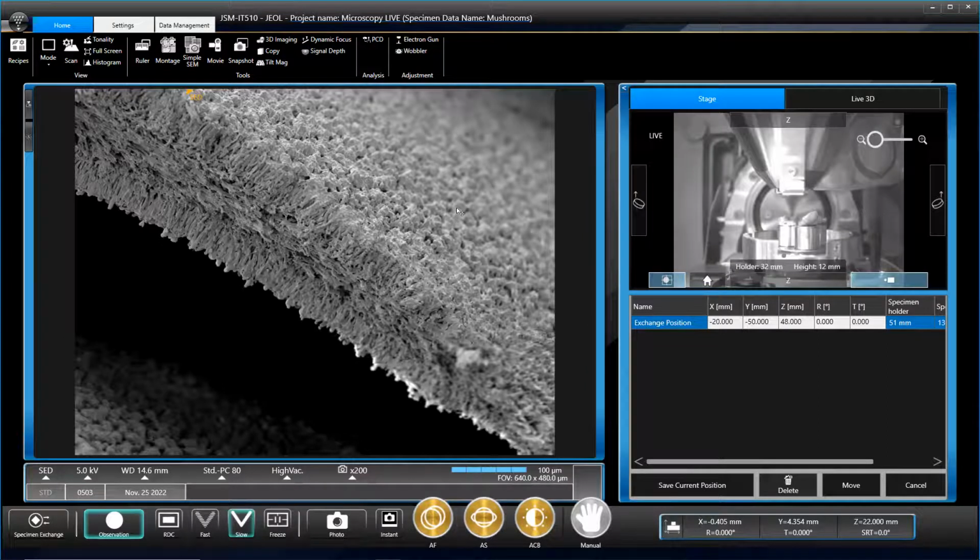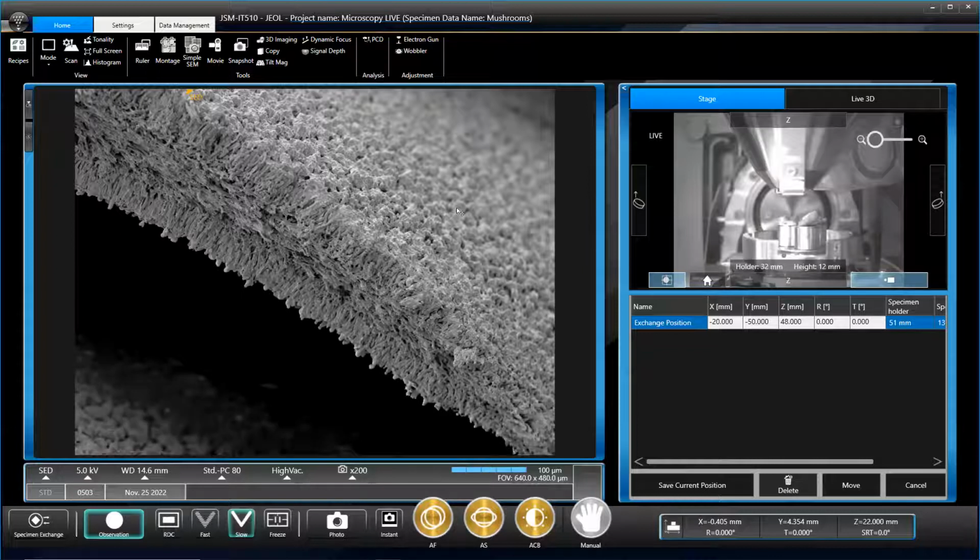That's a cool image though, Cesca. Really nice. That's very different to the other oyster mushroom. It is arty as well, like you see the shadow on the leaf. You quite like secondary electron imaging, so you get to have a little bit of fun with it.